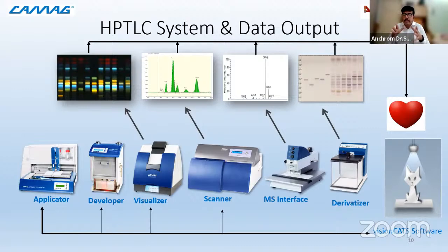And after that is the crucial part, that is a scanner. Now the scanner is more tuned to do quantification accurately. It has a wavelength from 190 nanometers to 900 nanometers. So it has the entire wavelength range, right from UV to visible, and a little bit of the IR part, but a negligible one. But it covers the entire range to give you the proper wavelengths which are required.